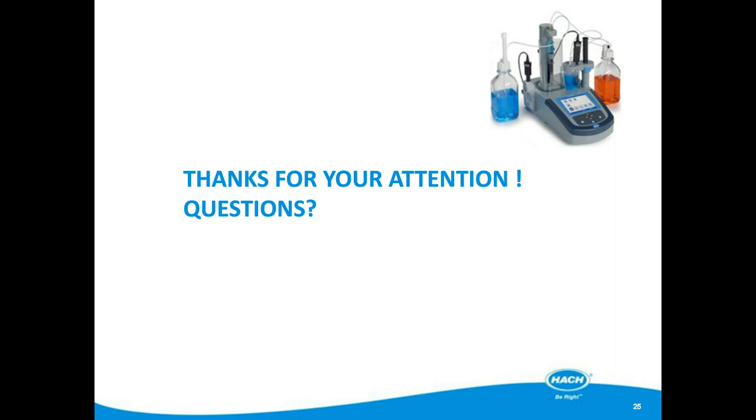I have another question coming in. What about measuring the water content? That is also a major parameter in the food industry. Yes, water content is another important parameter in food, and not in beverage, but in food.